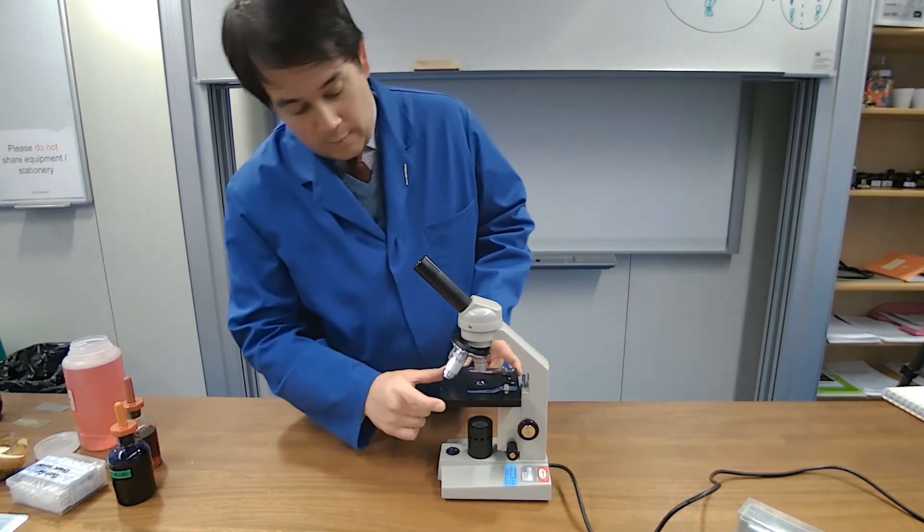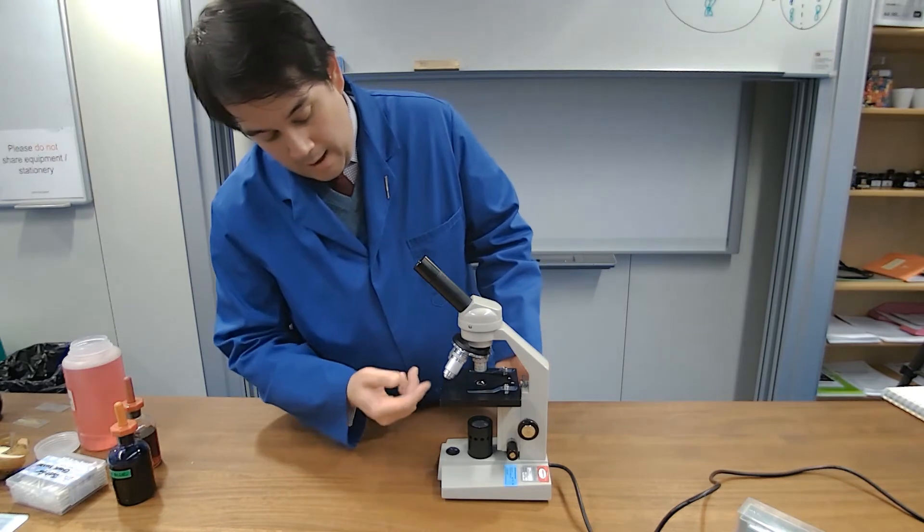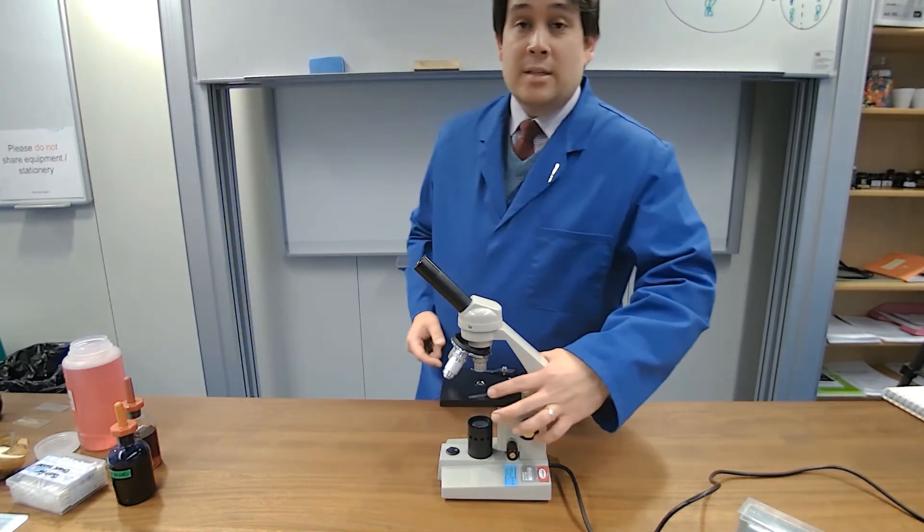We then have what is called here the stage which is when light shines through and the specimen sits on. And these are our clamps to keep this slide in place.